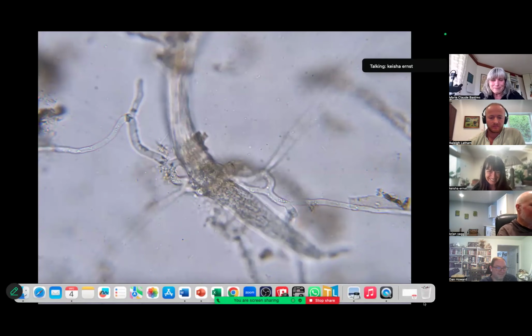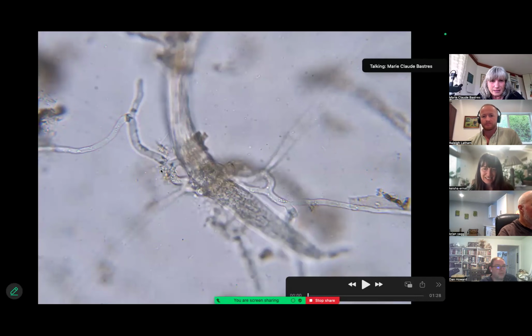But see, it's the same compost I showed you a month ago. So I found this. It has some rings, and this nematode is dead and it is trapped. So I'll play it now.